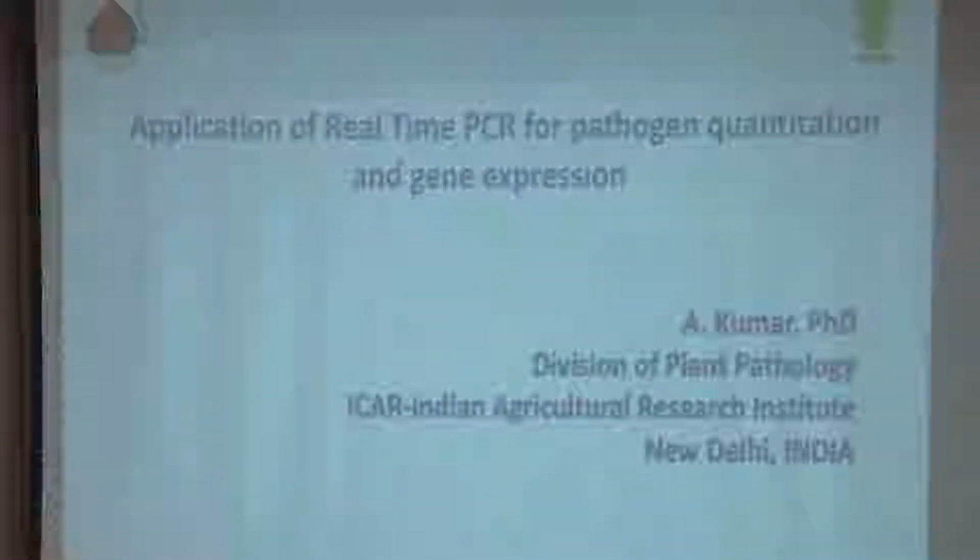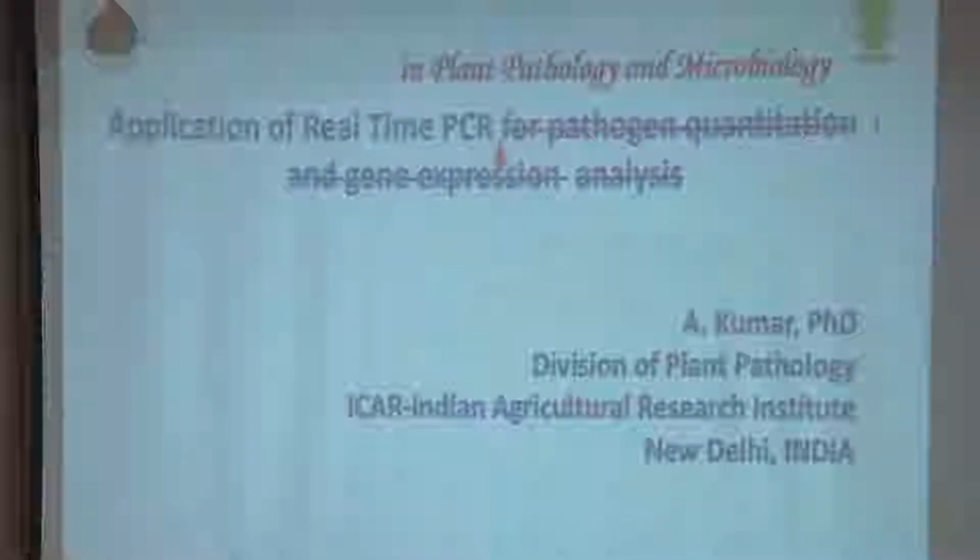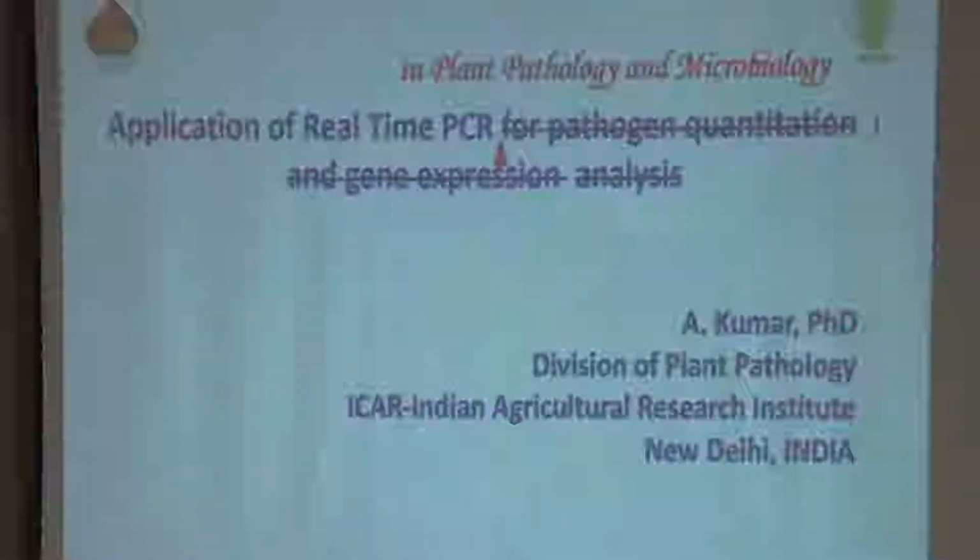So, application of real-time PCR for pathogen quantitation and gene expression. I put it in the title deliberately because these two are the major applications of this real-time PCR in our area of research, right? So I just changed the title. It's very simple: application of real-time PCR in plant pathology and microbiology.